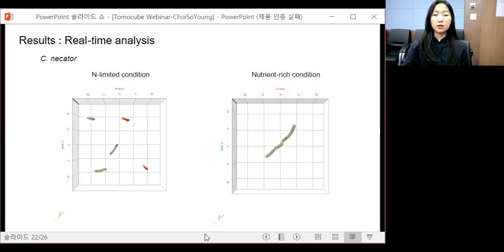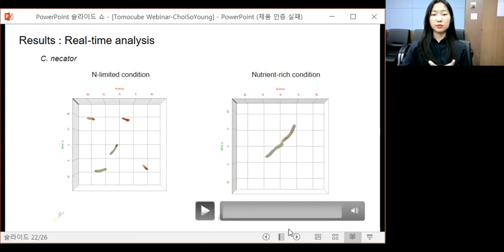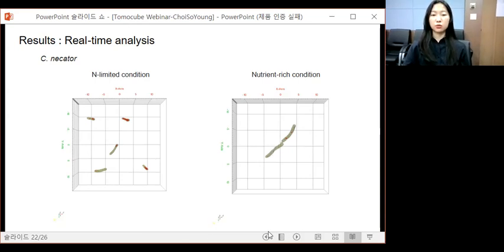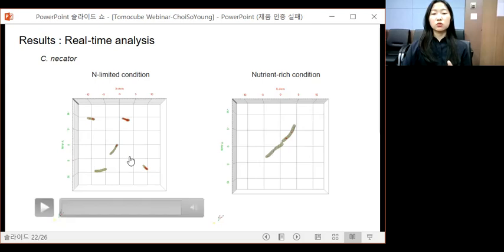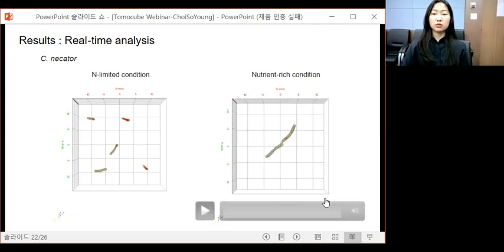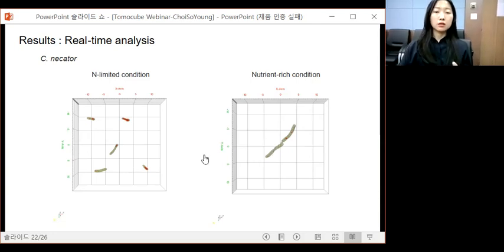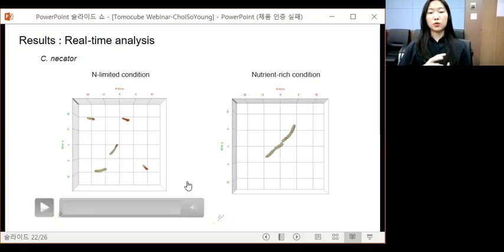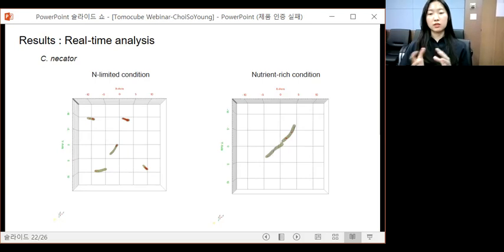For C. necator cells, we obtained two movies for different culture media. One is nitrogen source limited, and the other is nutrient rich medium, which contains sufficient nitrogen source. The two conditions differ in that nitrogen limited is good for PHA production, but nutrient rich condition is good for cell growth rather than PHA production. The movie shows the actual in vivo dynamics of PHA granule synthesis and degradation in living cells, even considering the possible existence of small optical perturbation caused by the cell movement.